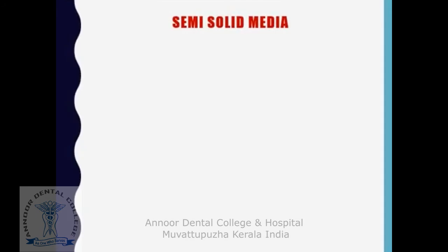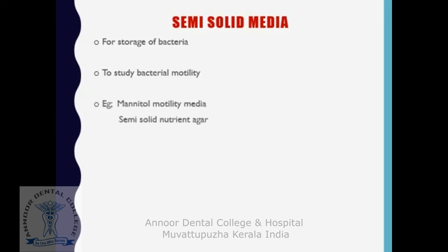Third is semi-solid media. Semi-solid media is usually used for the storage of bacteria and also to study bacterial motility. In semi-solid media, the agar percentage is very low, only 0.2 to 0.5. Because of that consistency, bacteria can move. That's why it is used to study bacterial motility. The common examples are mannitol motility media and semi-solid nutrient agar media.